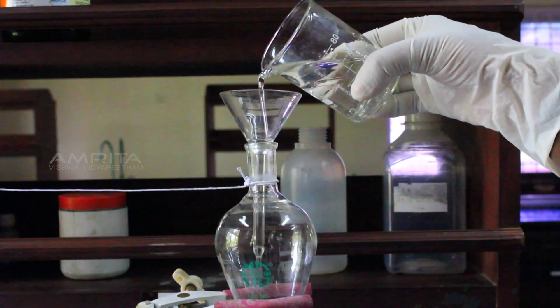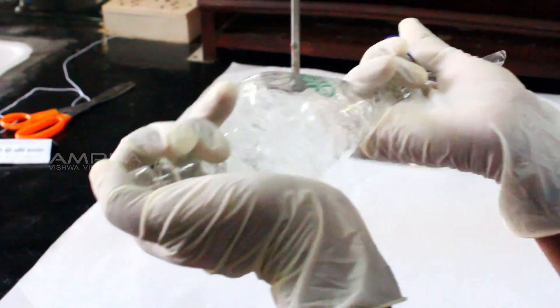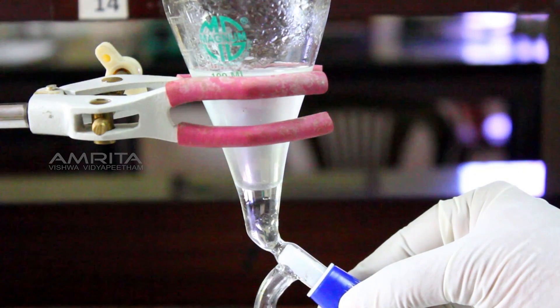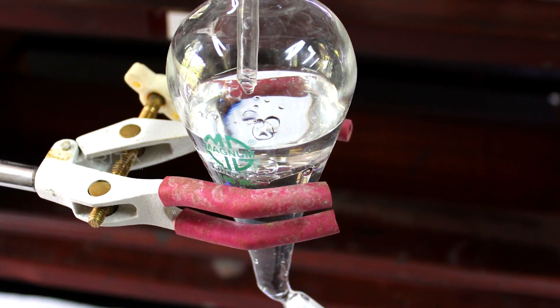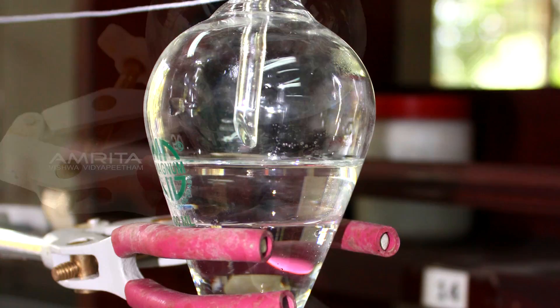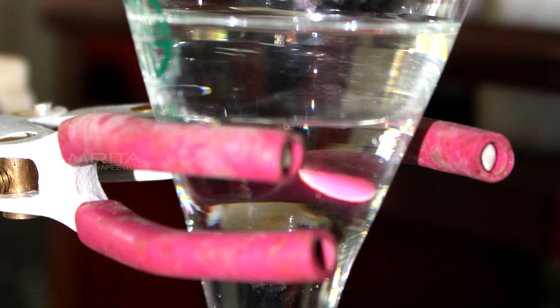From this experiment, we can infer that the immiscible liquids separate out in layers depending on their densities. Since water is the denser liquid, it falls to the bottom and forms the lower layer. As oil is the lighter liquid, it forms the top layer.